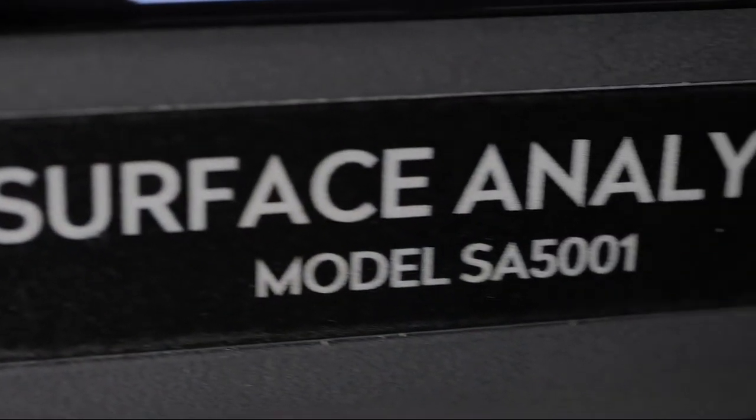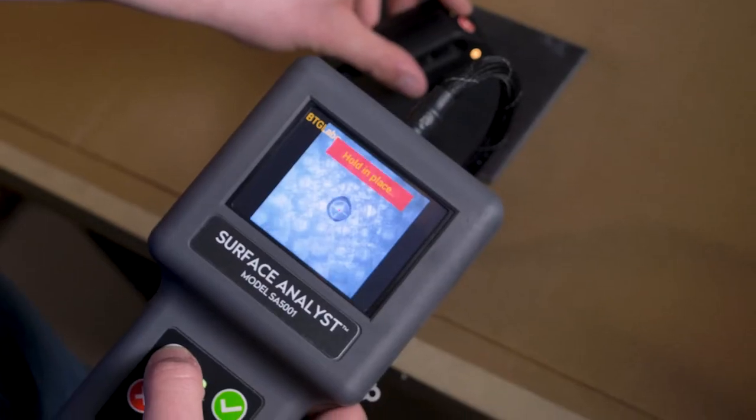The 5001 is a self-contained system that does not require to be fixed to a computer or tablet, making it completely handheld and mobile.